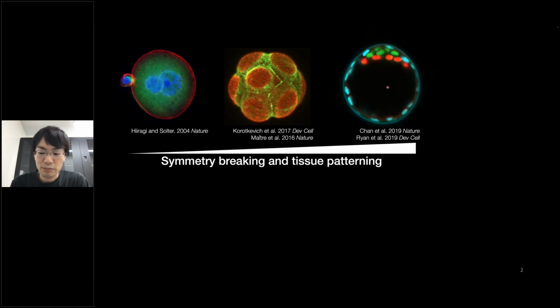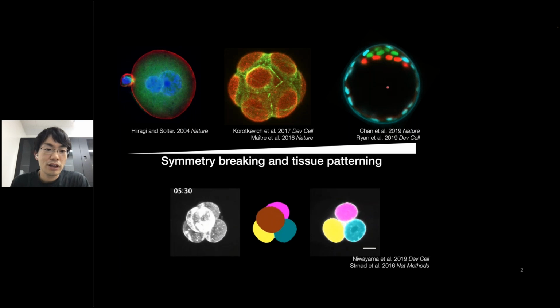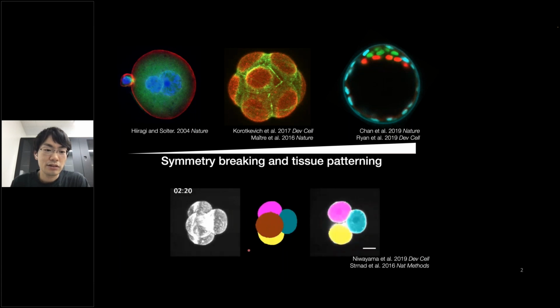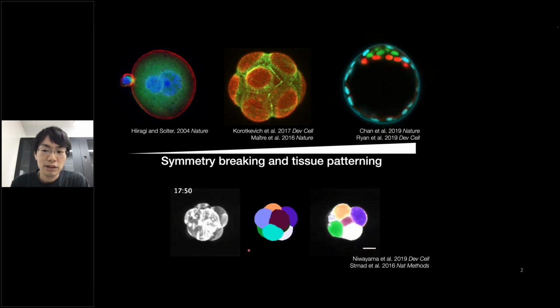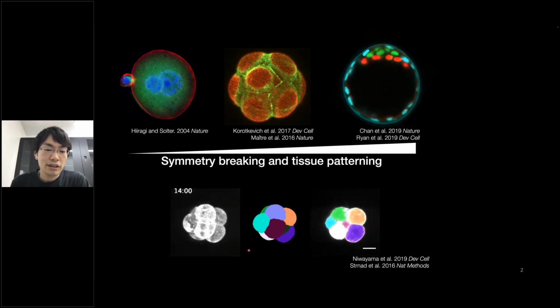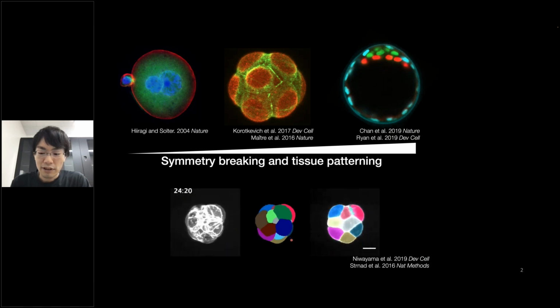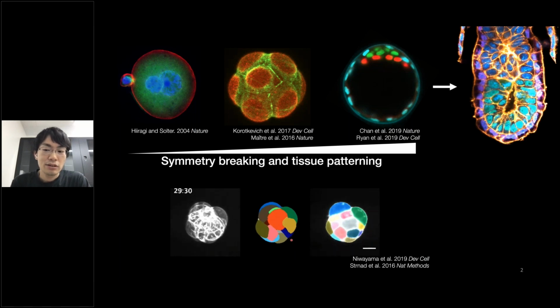To monitor such pre-implantation embryonic development, we have established a light sheet live imaging system in collaboration with Ralph Fünfgeld's lab and Jan Ellenberg's group in EMBL. I hope you can appreciate that with this method, we can capture highly dynamic processes in the development without compromising their development, which helps us to understand the mechanistic insights into the development. But now we are moving forward to a more complex system of the embryos, which is the embryos beyond the implantation.